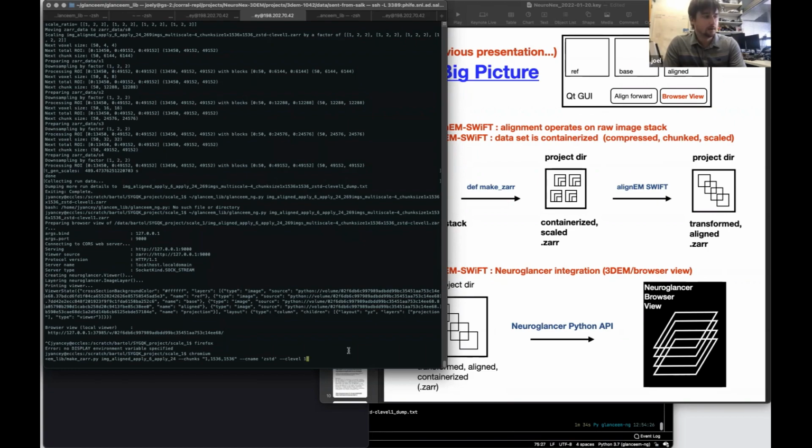So this all goes to the data pipeline, because we've already got the alignment code, and now we're reaching the end of having the data pipeline figured out: how the data is going to be formatted, how we're going to get it into the format, how it's going to be fast, and how it's going to be compatible with the Neuroglancer viewer. After I demonstrate this, I'll maybe pull up the Neuroglancer viewer. Maybe I'll just let Tom do it because he's got the big data set that doesn't fit on the laptop.